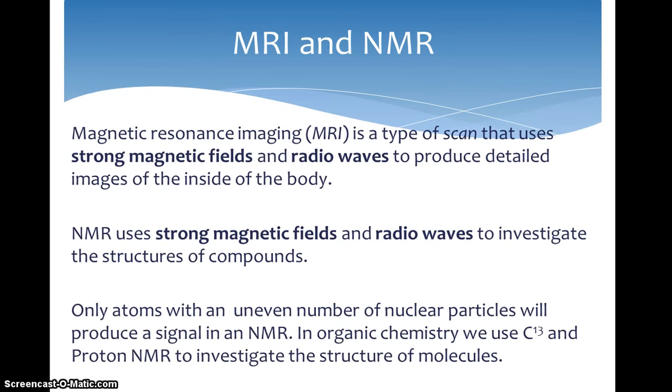First of all, you've probably heard of MRI as a diagnostic technique in medicine. It uses strong magnetic fields and radio waves to produce detailed images of inside the body. NMR uses the same principles and we use it to investigate the structures of compounds.